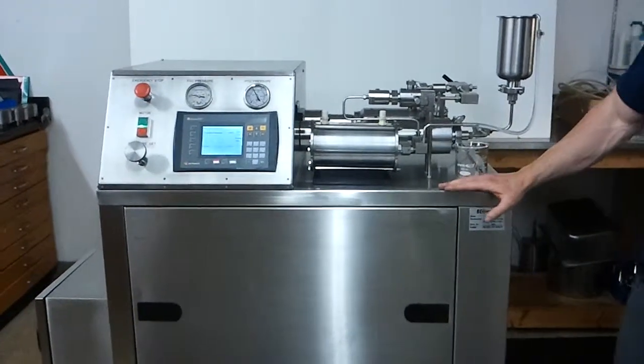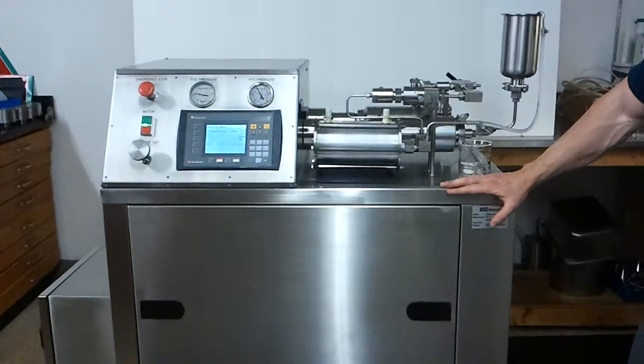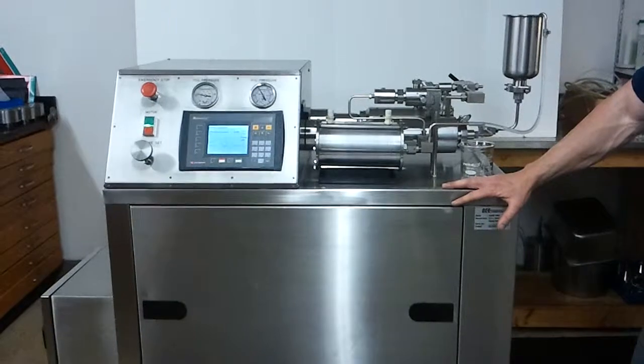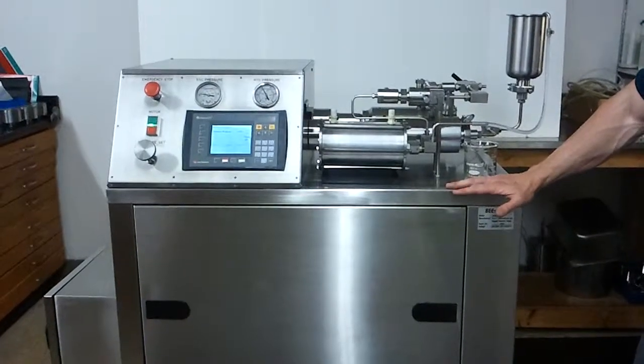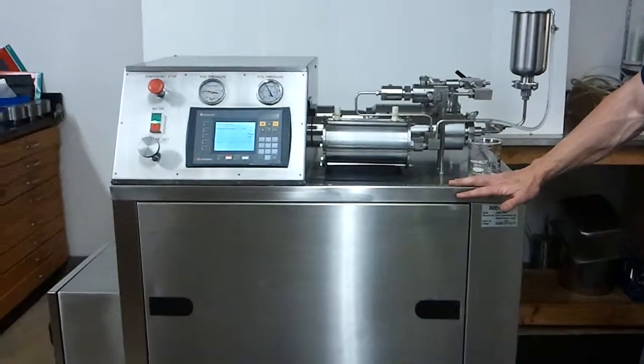This is B International's DB2000. It's our pilot scale high pressure homogenizer.